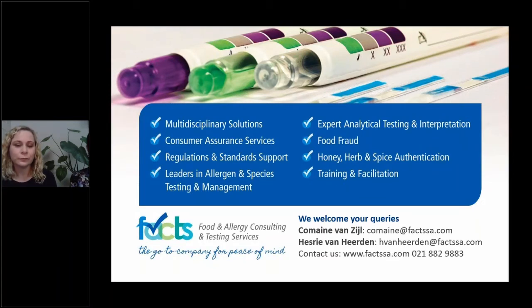Right, so I've got some complicated questions for you. I hope you had your cornflakes this morning. Okay, good question here from Justice. Justice is asking, during allergen cleaning validation, I think it's probably verification, is it necessary to inoculate the surface with a specific amount of allergen in question? Now, you've mentioned the positive and the negative controls, making sure that the test kit can actually pick up what you want it to pick up. But I think his question is whether it is sensitive to a particular level, in which case I need to make sure that I test it at that level?